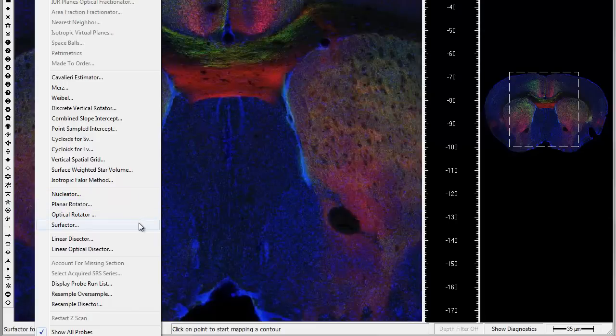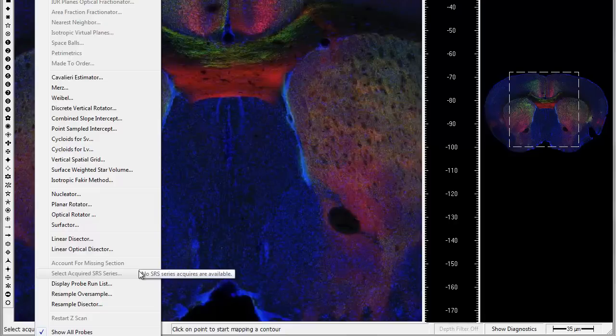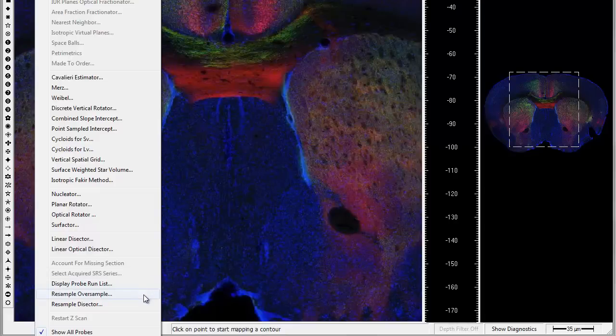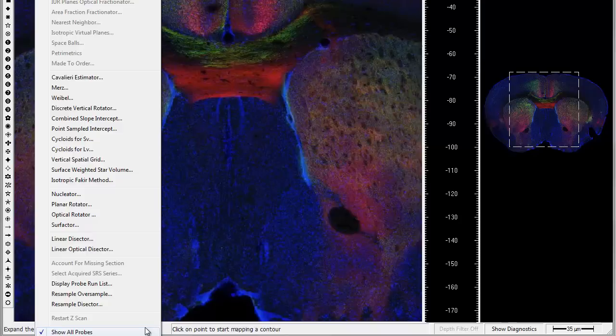These probes drive StereoInvestigator, whether you are working live from a light microscope, with a confocal microscope, or using image stacks or high-resolution virtual slides. Now, for a brief overview of a few of the probes in StereoInvestigator.